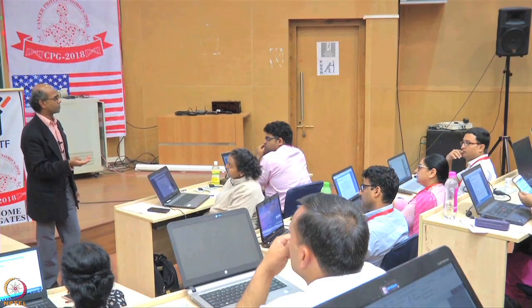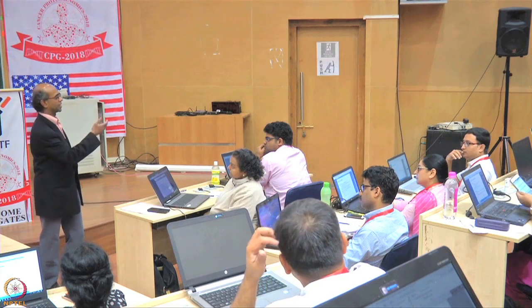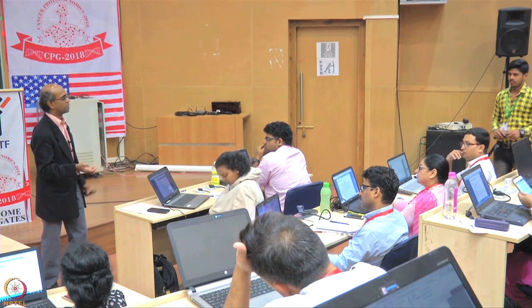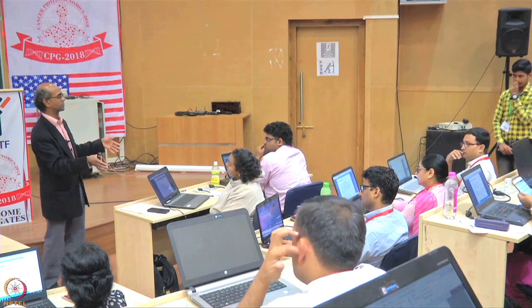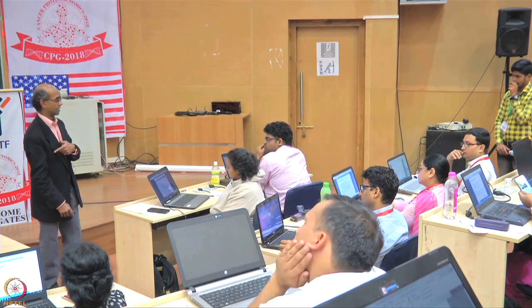You have only 10 samples that you can put on a TMT 10-plex. And then you submitted it, and the reviewer came back and said, run it 2 more times. So then you can run it 2 more times. You don't need a reference. But if you are doing a study which requires 15 TMT 10-plexes just to do one replicate of the study, then you would have a reference because you have to link the different 10-plexes.